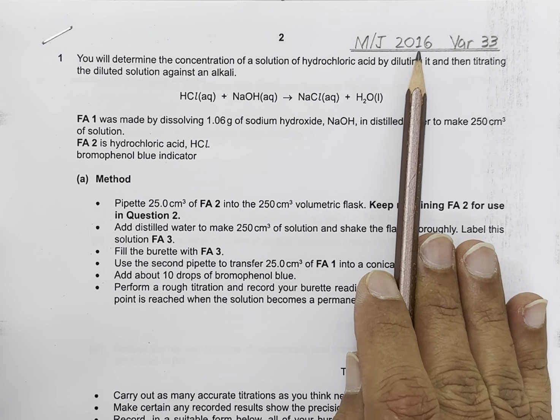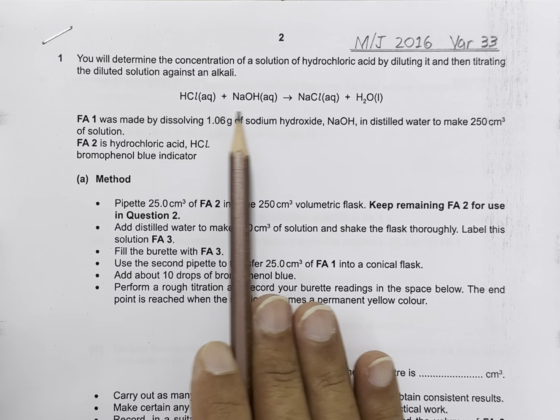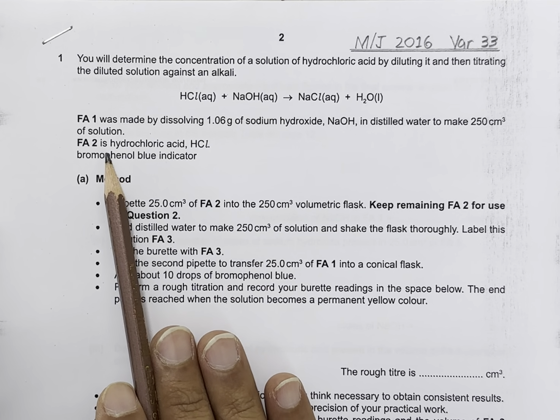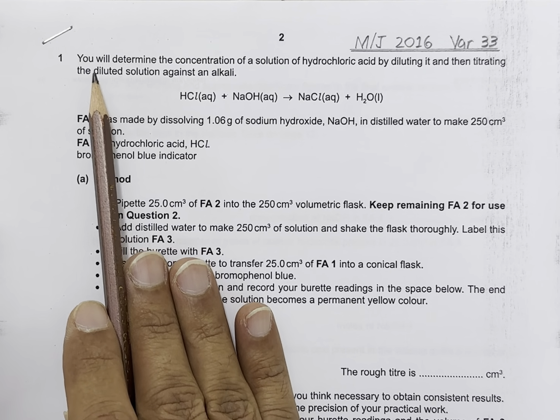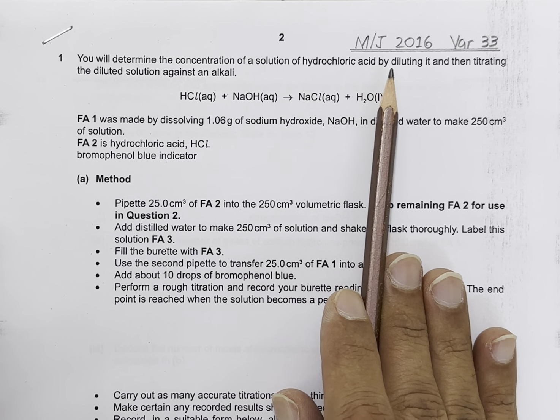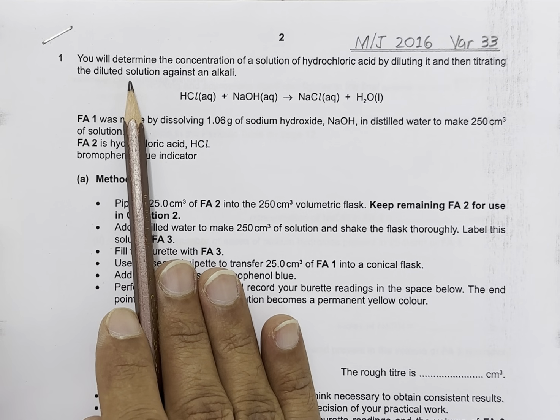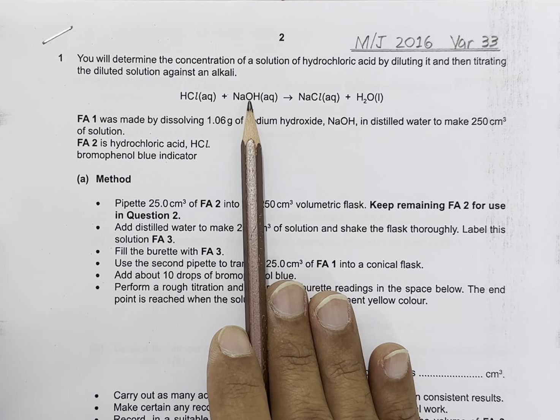May-June 2016, variant 3.3. It's an acid-base titration with a prior dilution of Fa2 hydrochloric acid. The question says you will determine the concentration of a solution of hydrochloric acid by diluting it and then titrating the diluted solution against an alkali. Acid with an alkali.